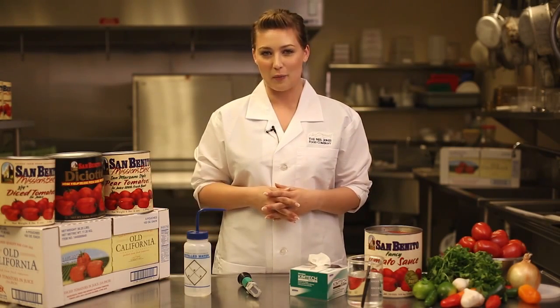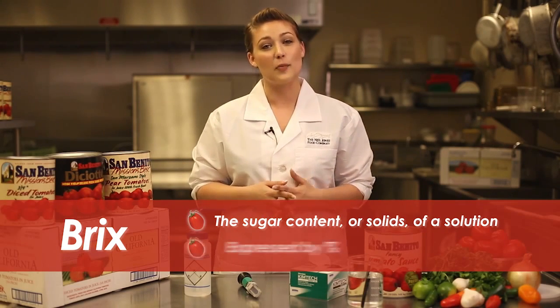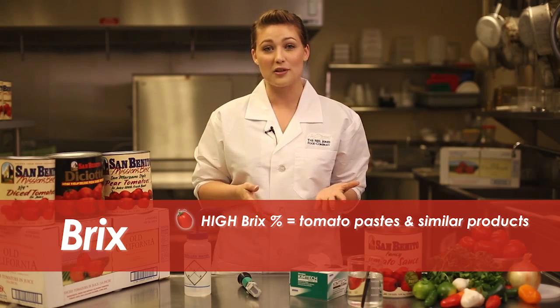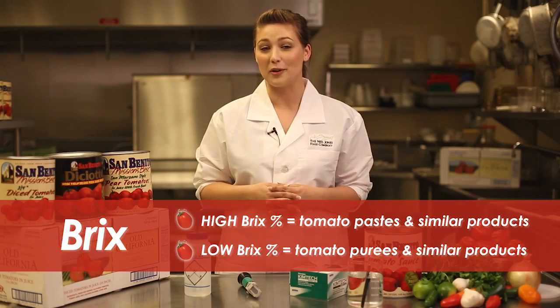A common measure in evaluating tomato products is known as BRIX. BRIX equals the sugar content, or solids, of a solution, and it's expressed by a percentage. A high BRIX percentage equals a more concentrated product, such as crushed tomatoes or tomato paste. A lower BRIX percentage equals something more like a tomato puree.